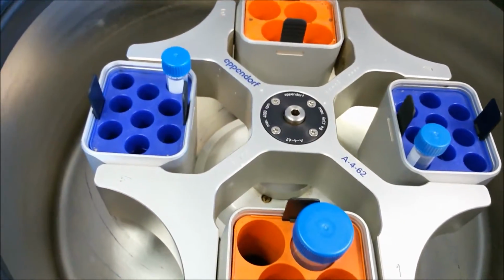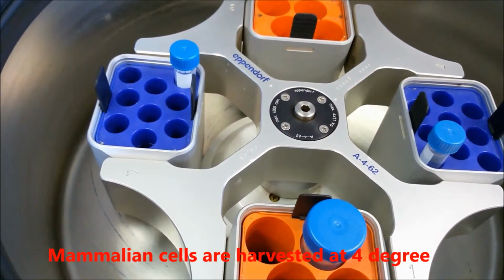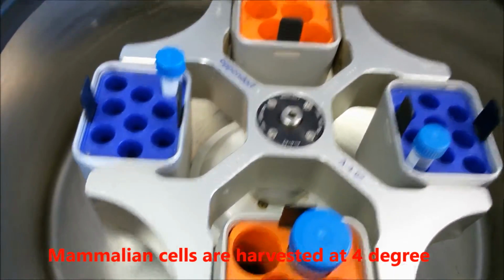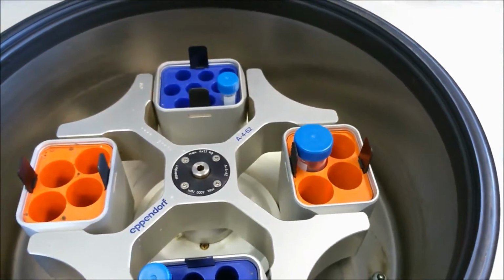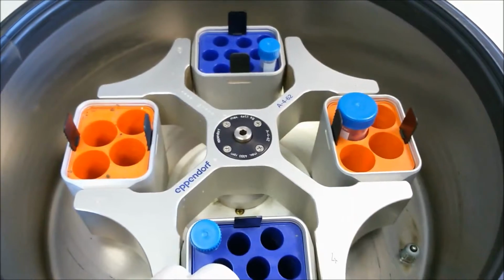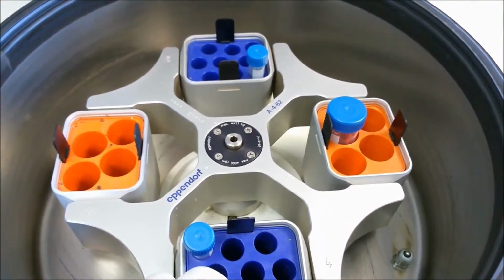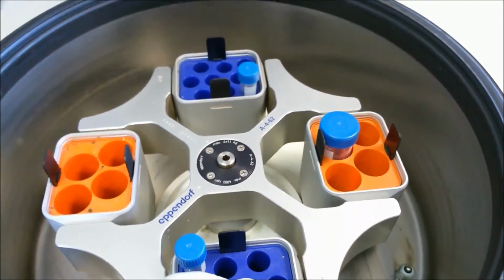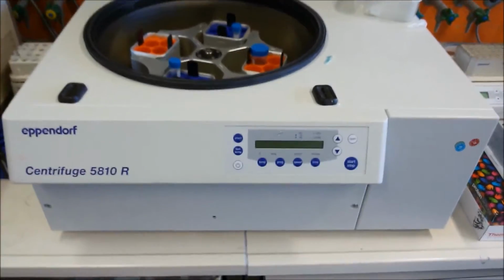This kind of centrifuge can be used to collect cells. So if you grow some cell culture and you want to collect the cells from the media, you can use this centrifuge, or for different purposes. So we will use these terms that you use: Falcon tube centrifuge, tabletop centrifuge, maybe some temperature something. So if you're listening to any such term in the tutorial, then just think about this giant big machine.